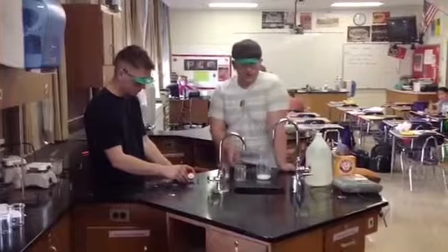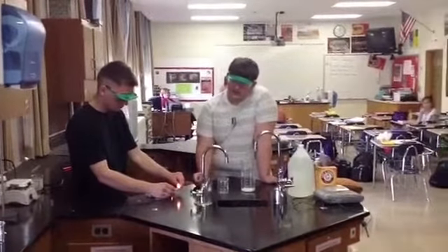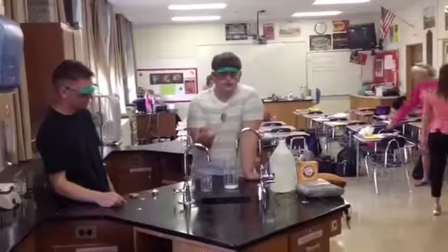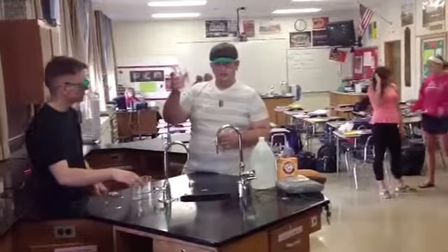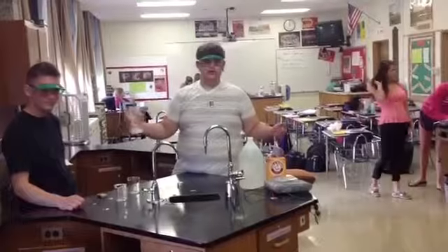To illustrate that there is carbon dioxide in this cylinder, I'll take the candle that can be moved around a bit more readily. Just into the cylinder, goes right out. Carbon dioxide. Without oxygen, fire cannot continue. So if you take a full cylinder of clear gas, pour it right over the candle, goes right out.